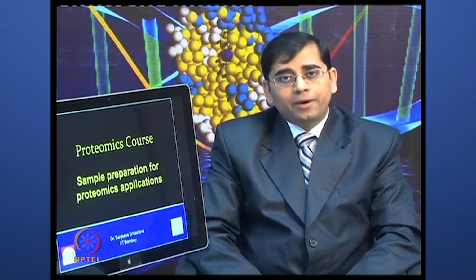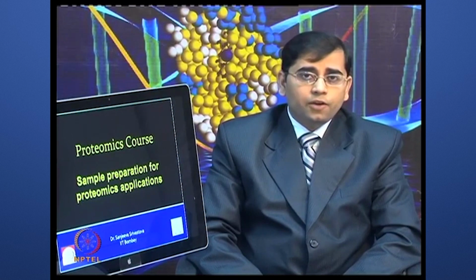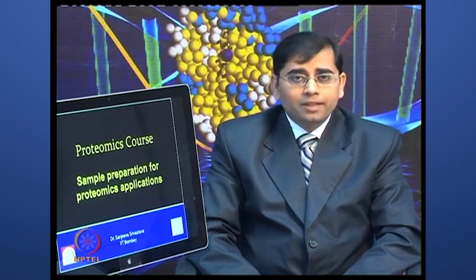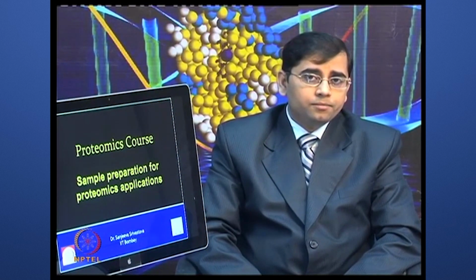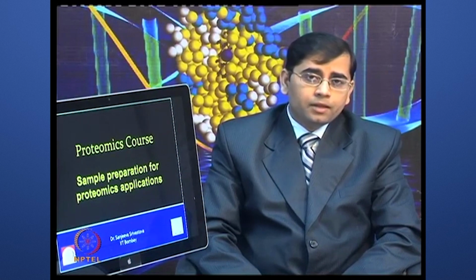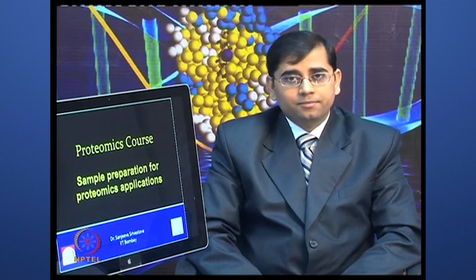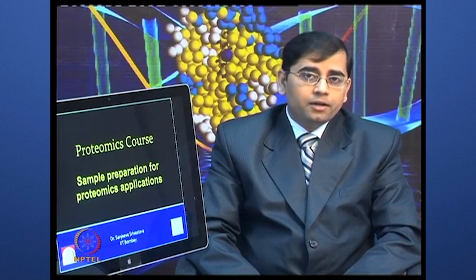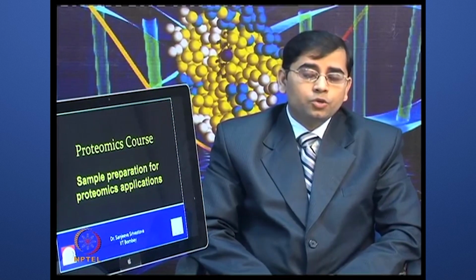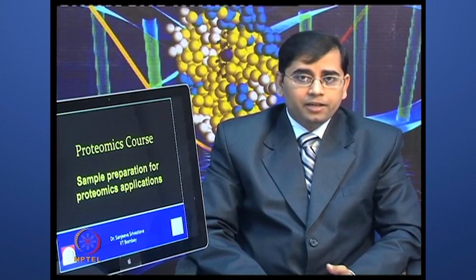Often, each type of biological sample poses its own challenges. For example, if you are working on bacterial cultures, plants, or human samples, different body fluids such as serum, urine, saliva or cerebrospinal fluid, each sample type brings its own unique composition and its own challenges. Now, when you are performing a sample preparation, you have to be very cautious about what sample you are processing. You cannot follow a generic protocol. You have to optimize the conditions depending upon your sample.